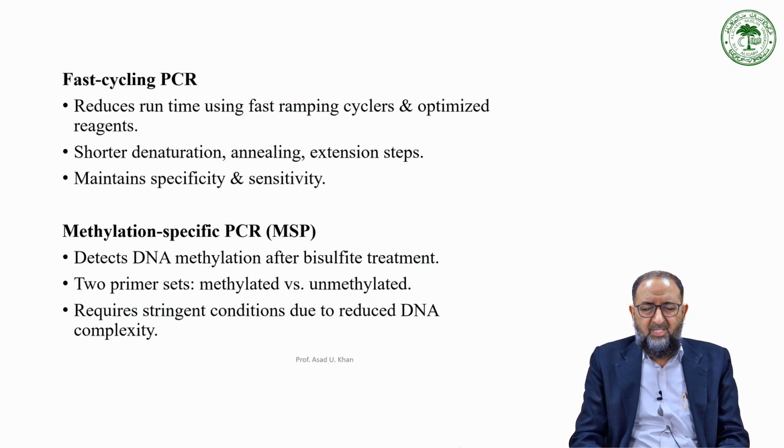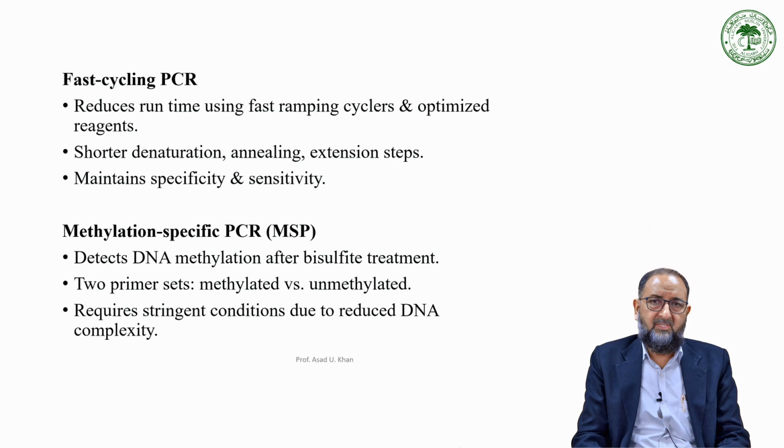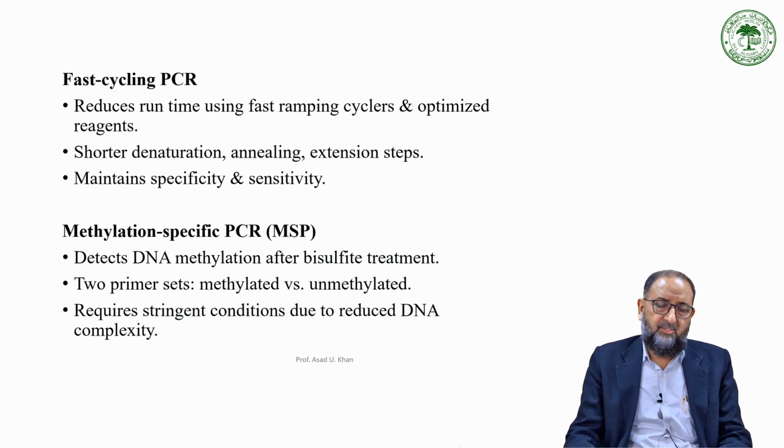Then a short denaturation process is again important, because in this case hot start PCR works well. We can have quick high boiling temperatures for a short time with the DNA taken without enzyme, and then you add the enzymes to initiate the cycle process of denaturation, annealing, and extension. It maintains the specificity and sensitivity also.